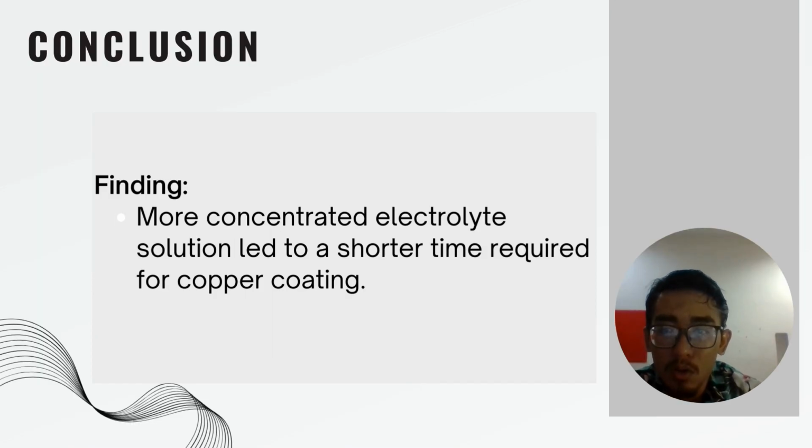So for the conclusion, in this experiment, we can conclude that the more concentrated the electrolyte solution, the shorter the time required for the copper to coat the coin.